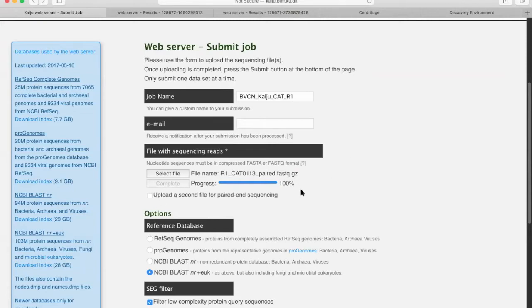If you're going to rely on short reads, I do recommend using your paired reads, which means you have to do one of two things. A, you use the reads as you got them from the sequencing center without any quality control, or only trimming by length to ensure that you have paired reads throughout, so you don't have any reads that are not paired.